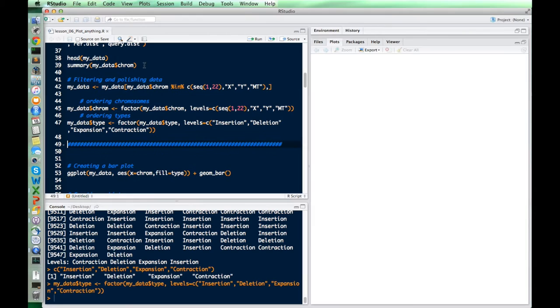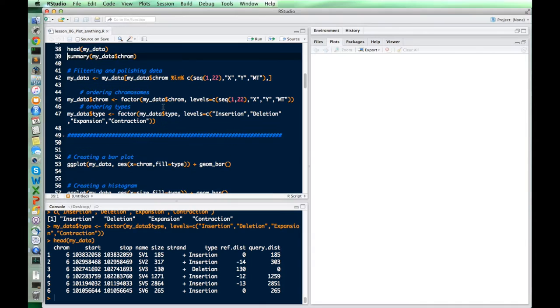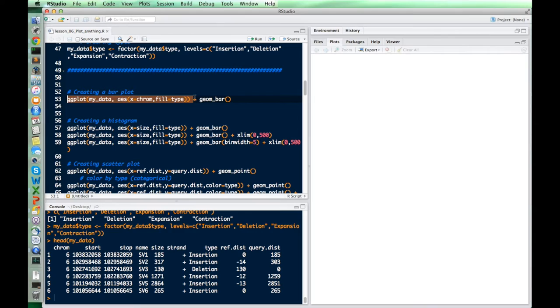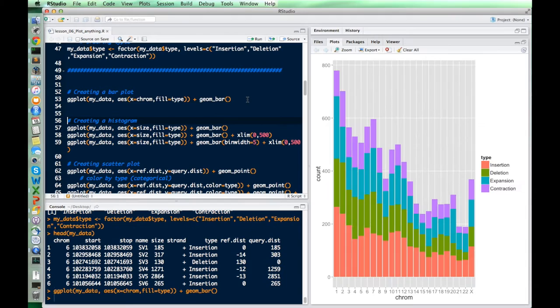Now let's do head of my data — it basically looks the same. To create a simple bar plot, the anatomy of one of these plots is: we say ggplot, then we have the data, then the aesthetic. You put what you want each part of the plot to represent. Here the x-axis is chromosome and the fill color is type — insertion, deletion, expansion, contraction. Then we add geom_bar to make it a bar plot. We can see chromosomes are in order, types are in the order we wanted, and there are no extra chromosomes.